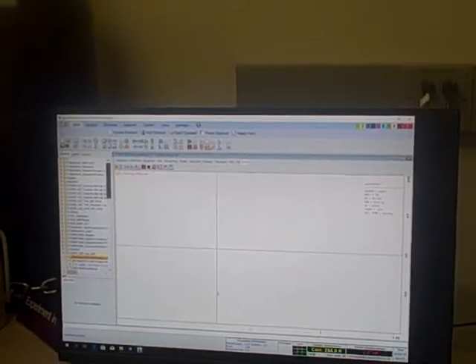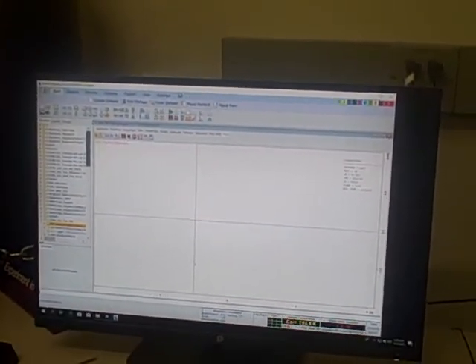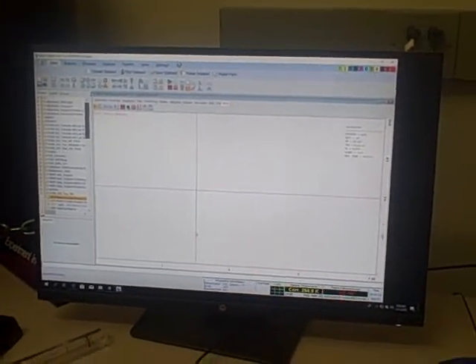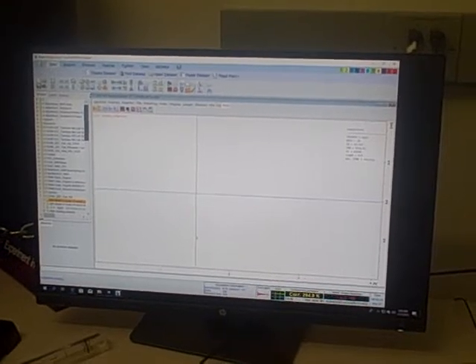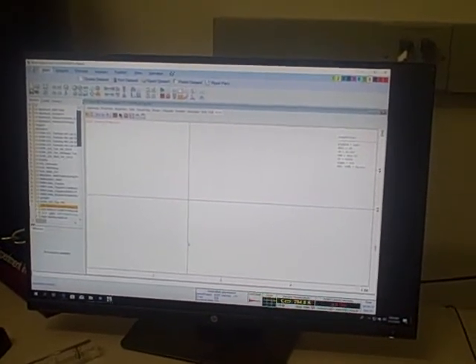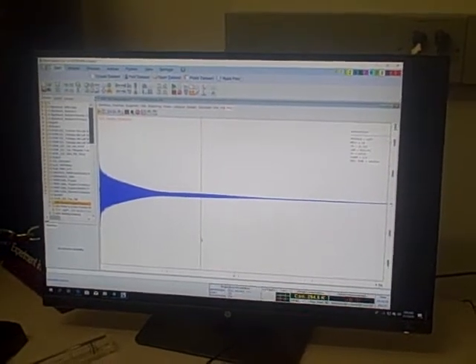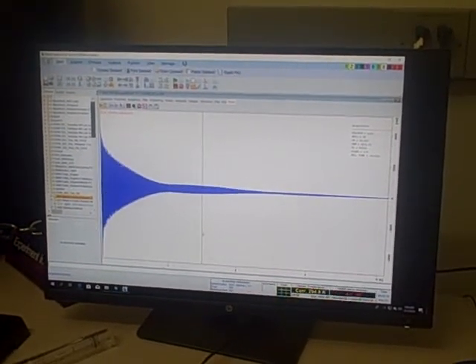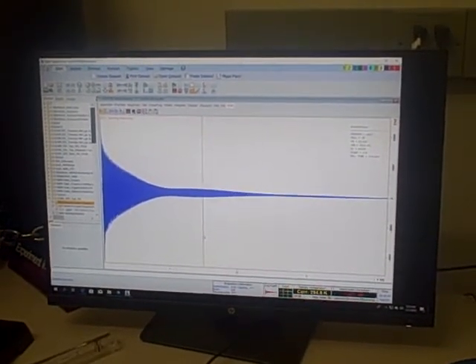After about 50 seconds, our NMR will be run. First thing that happens is the NMR runs a couple of dummy scans and discards the data. And then it will run 8 individual scans, averaging them to get your signal. The first thing that's going to pop up on the screen is what's referred to as the free induction decay, or FID. This data will then need to be transformed into a form that is usable for interpretation.